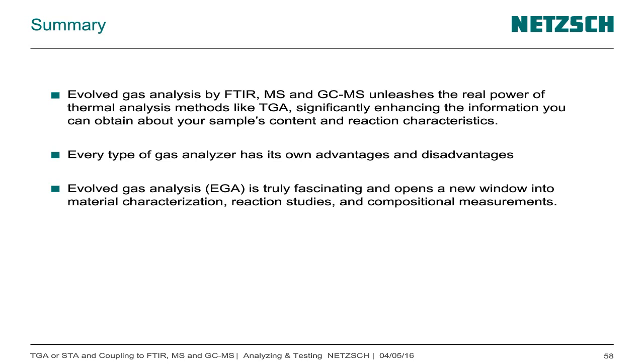With an FTIR, you see the hydrogen fluoride pretty well. What you must look at is how big the linear range is and how to calibrate the FTIR, but it shouldn't be a problem. With columns, with the GCMS, I wouldn't do it, with the columns which I have used during my lifetime until now. So it's possible.